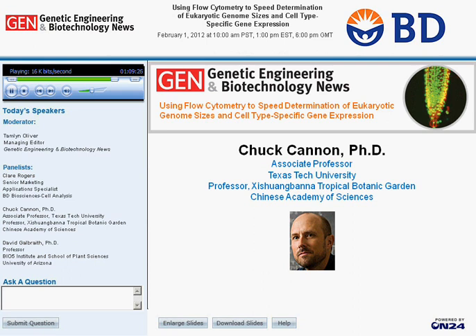And if you're using root tips sometimes and leaf material some other times, standardizing that is rather difficult. So if you're doing some kind of diversity study, I think it would be difficult to automate, because you're going to have to refine your technique with each one. But if you're in more of a crop, more industrial setting, you could probably do that.